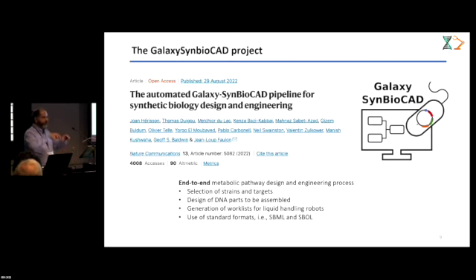How we can interconnect them together and create a full workflow, what we call an end-to-end metabolic pathway design and engineering process. So that all of these steps, like selection of strains and targets, design of DNA parts, generation of work lists for liquid handling robots, are all addressed, so that you end up having the instructions that should be uploaded into your OpenTrons, for instance, and everything by using standard formats like SBML and SBOL.